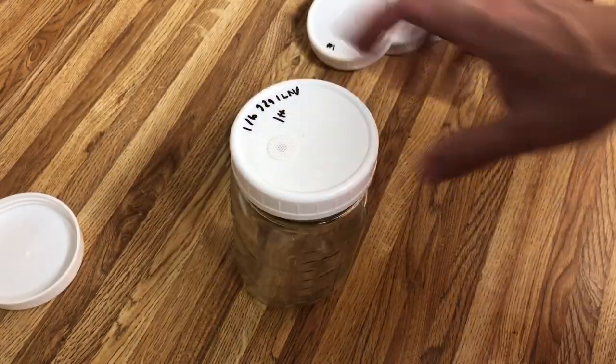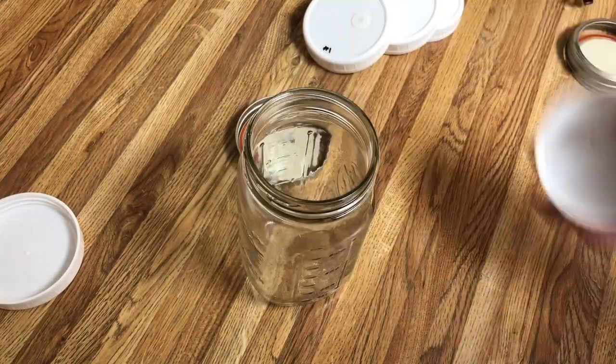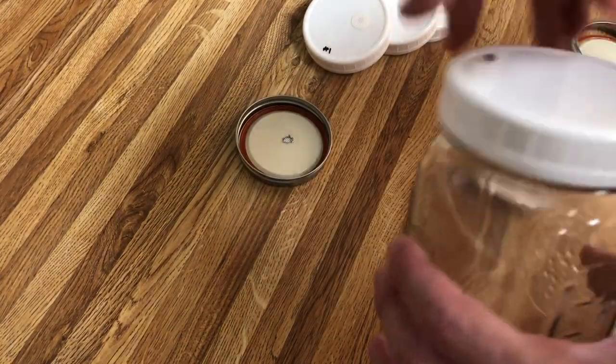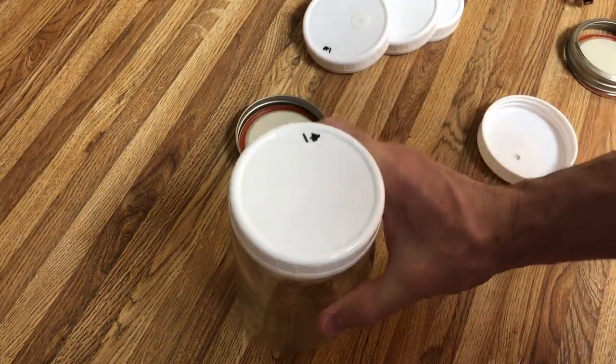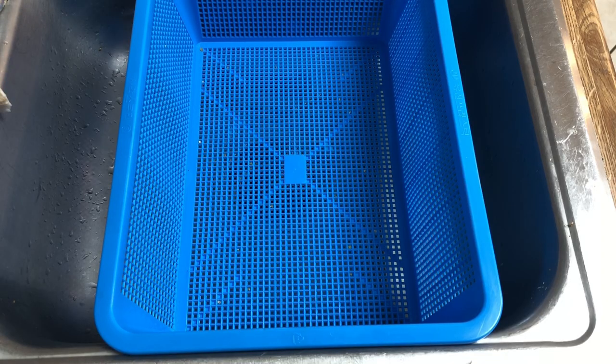So these are the lid options that I would go with. Any of them work. I've done them all. Like, I mean, I've run 100 plus jars with unmodified metal and plastic lids, just slightly loosened. Never had an issue. So now our grain has been soaking for 2 hours.